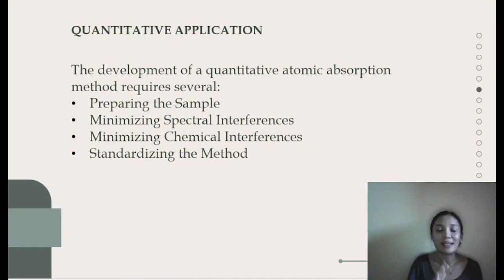That is why I emphasized a while ago that we must carefully choose our apparatus that carries out radiation sources. Next, it occurs especially during the sputtering process, the collision of ions in the cathode and anode of our cathode hollow lamp.